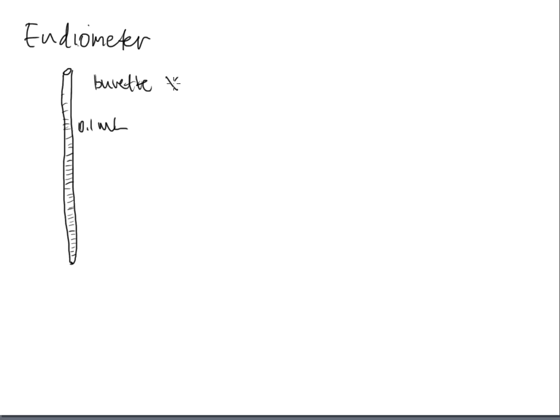So they are not a burette, okay? Let me just make that clear. It's not a burette. The reason is that a burette would be very long, and the opening would be up here at the top, just like the eudiometer. And the burette would have these markings all the way up and down it, just like a eudiometer. And the end of the burette will often have a pointy tip that will drip your solution into a container with a stopcock.